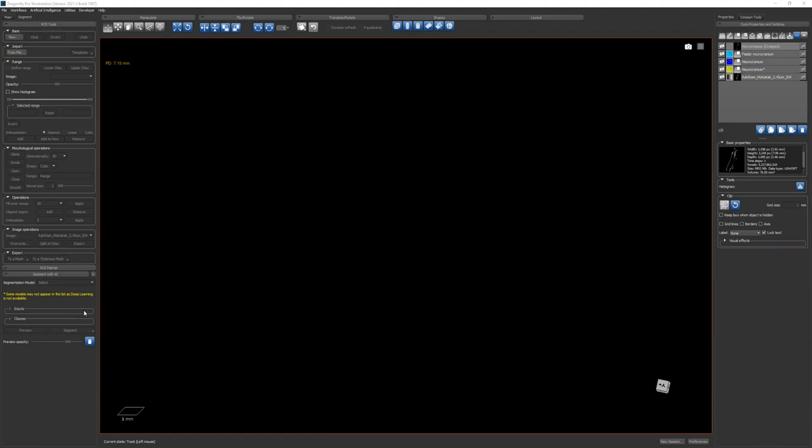So our volume is somewhere. Neurocranium, right? It's missing. Maybe it's at the end. Try again. There it is. Weird.